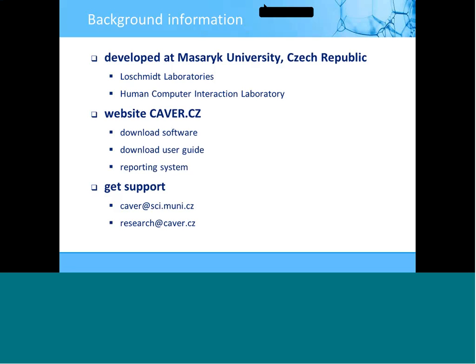propose new features for the Caver. Then regarding the user support, there are also 2 mailing lists where we will be happy to answer any questions about Caver usage and help you to set up your system, the calculation for your system.